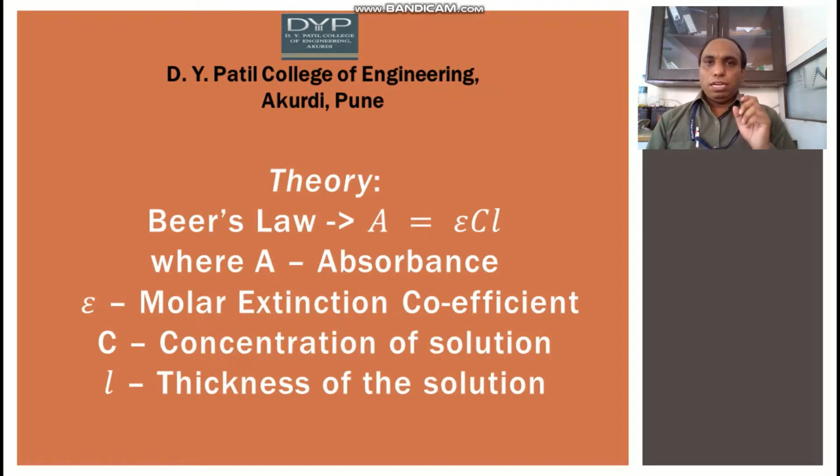If we understand absorbance, it means the tendency to absorb some radiations. As we know, a water sample, tea or any colored material absorbs radiation. The same phenomenon is going on with respect to solution. The solution like copper sulphate solution absorbs radiation. Now how much radiation is absorbed? That we are going to see depends upon the concentration.